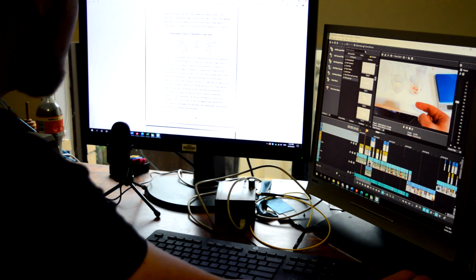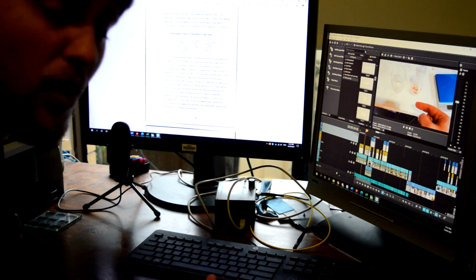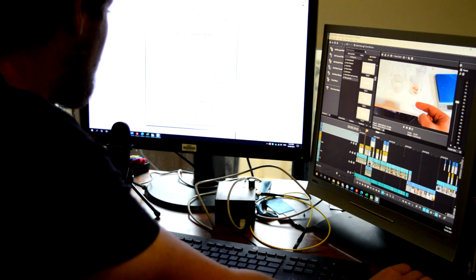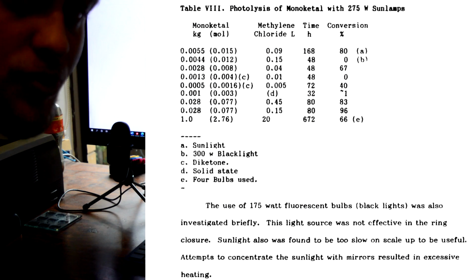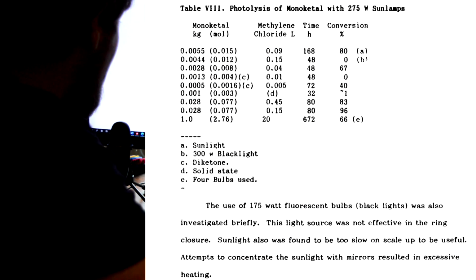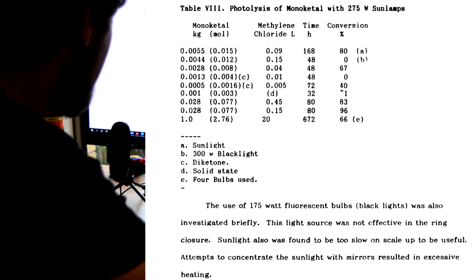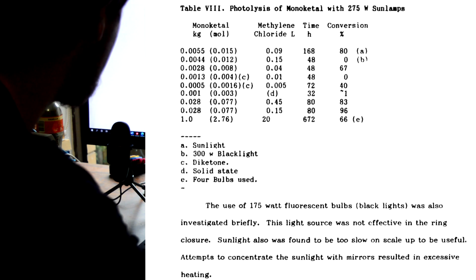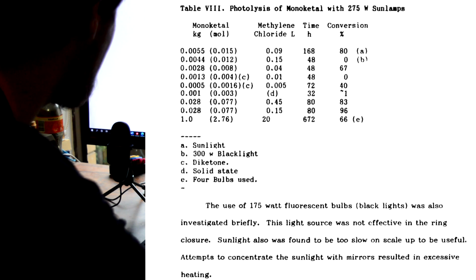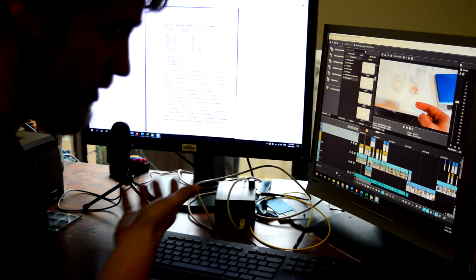In the 1989 paper, which is the most detailed out of all of them because they list things that they tried and didn't work too well, they use quite a few of them, including sun lamps and just straight sunlight. Most of them do work, however they only work well on the small scale, so they end up going to medium pressure mercury lamps for large scale. But even the sunlight did actually work to convert gram amounts, and that's what we're doing. We're working on the gram amounts, obviously.